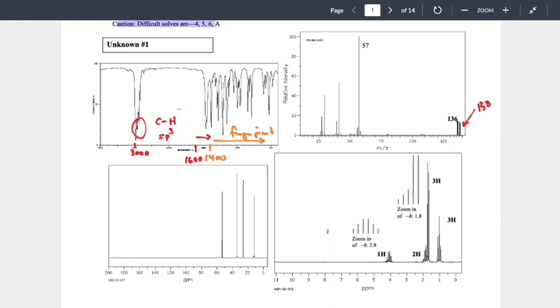Each of these pieces of information contribute a little bit of the puzzle. You can't entirely keep them separate. You do have to cross-communicate between each of the layers. So if IR tells you an oxygen is present, when you get to mass spec it doesn't say anything about oxygen. IR is the one telling you oxygen should show up. This could be a good reason why we do IR before we do mass spec, because IR can give us some of that context about oxygens. Does that make sense? Very good question.